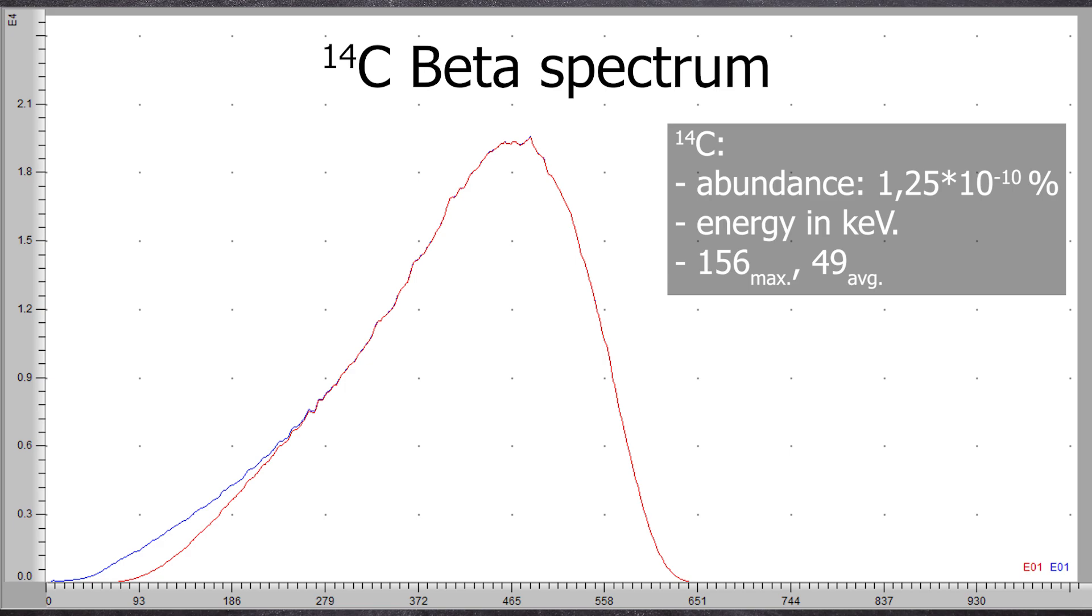The spectrum we can see here corresponds to a classical beta spectrum. The LSC has a maximum efficiency of up to 100% for betas. The gammas of an LSC sample pass right through the cocktail without noticeable interaction, but they can still disrupt the measurement through the photoelectric effect if, for example, a gamma calibration standard is right next to the device.